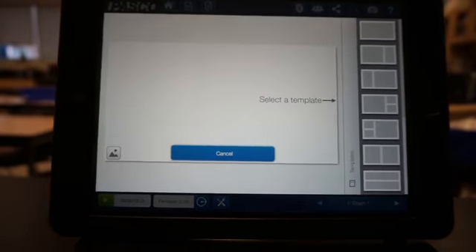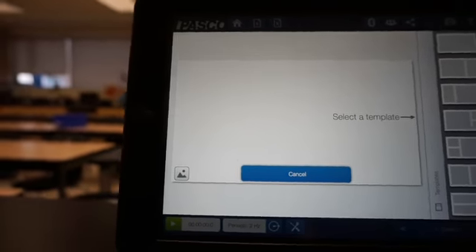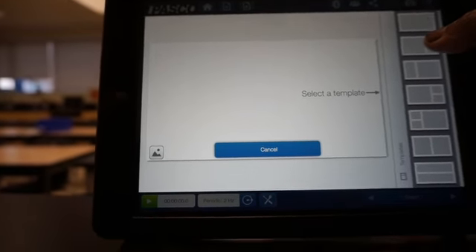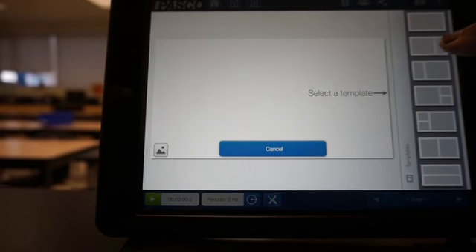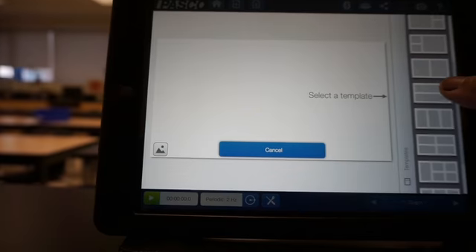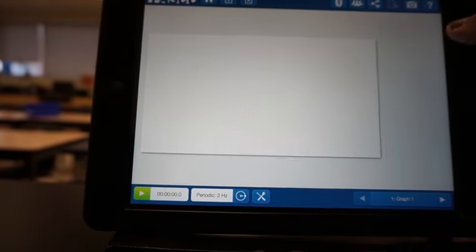So it's two different measurements I want, or two different displays. So I'm going to click on this option here. That's one panel for one display, 2 panels for a big display and a small display, 3 panels for a big display and 2 small displays, and so on. There's a whole bunch of different panels. I'm going to select this one.